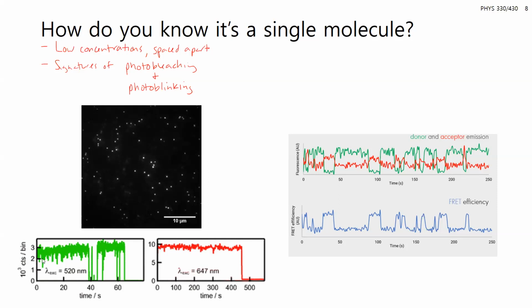Yeah, so Bill's saying that this one's showing both. And Catherine says photoblinking and maybe some photobleaching. So to confirm that it's photobleaching, you'd have to keep observing for, I guess, a while. But the fact that whoever put this data together cut it off is probably indicative of photobleaching that took place.